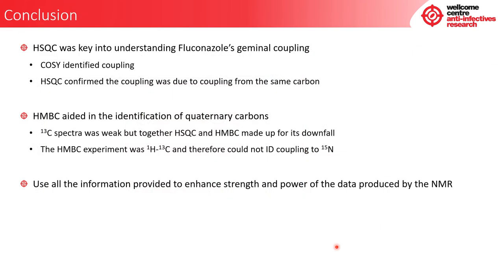So what are the conclusions of what we've learned? Well, we did manage to determine the structure of fluconazole, and we're able to assign each of the carbon peaks and the proton peaks to that structure. But how did the experiments help us?